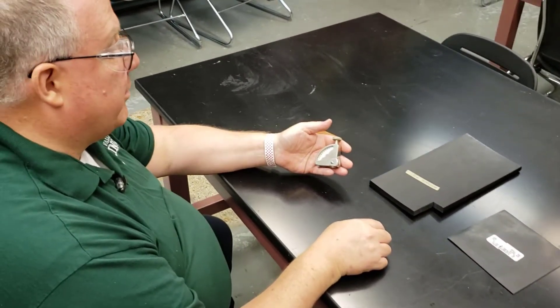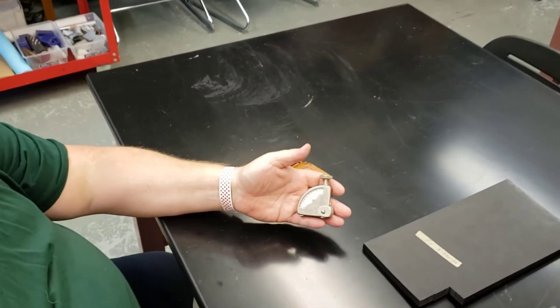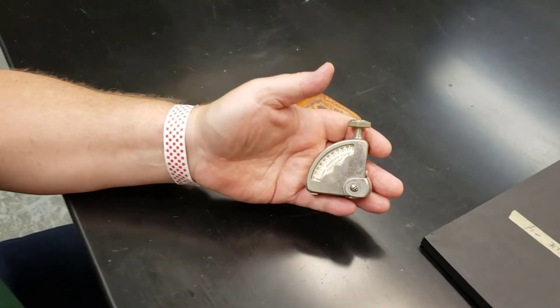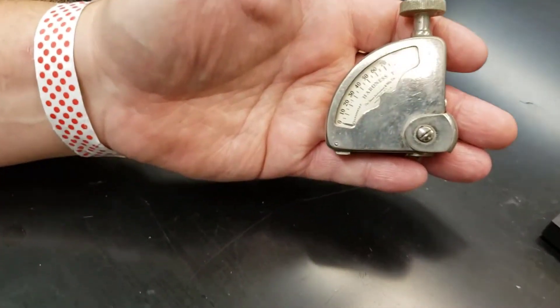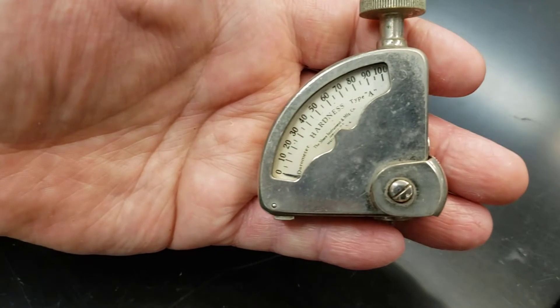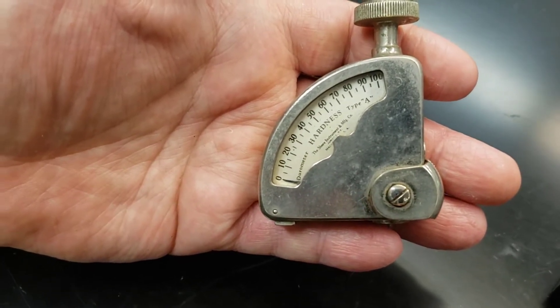This is a shore durometer type A tester. They go through D just so you know. This is used for doing polymers and it's a hand tester.